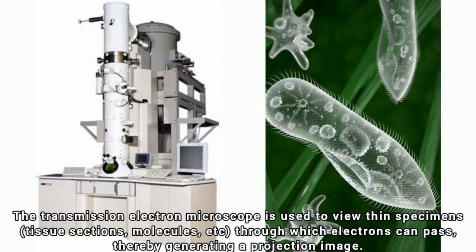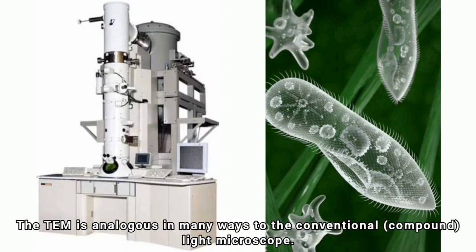The transmission electron microscope is used to view thin specimens like tissue sections, molecules, etc., through which electrons can pass, thereby generating a projection image. The transmission electron microscope is analogous in many ways to the conventional compound light microscope.